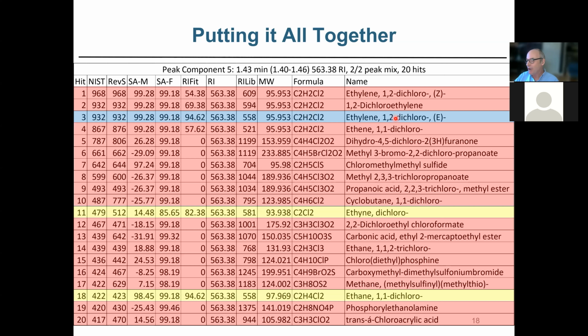So what we've done here is we now have a tool that, well, your eyeball is the best, but we assist you with the computer to help you quickly identify, because normally you'd look through all this data and try to make sense of it. We let the computer do that for you and visually mark what it thinks is the right answer. So that really accelerates the review process.